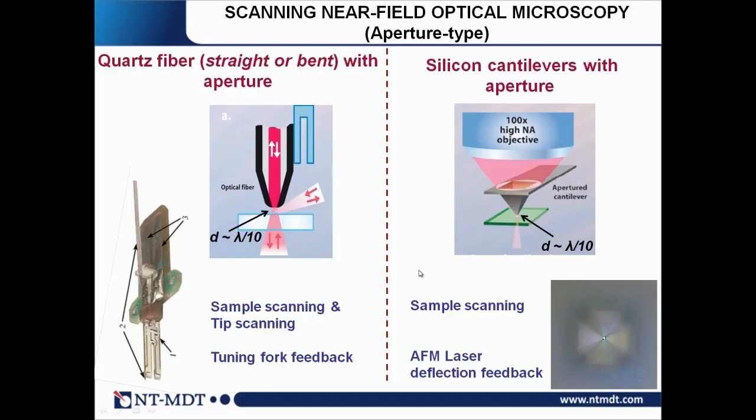So I would like to finalize my today's presentation with a scanning near field optical microscopy technique. This is another approach to optical imaging with a resolution beyond the diffraction limit. It works nicely with highly optically active samples which have a lot of light on the surface. It does not work with Raman, and this is a classical technique already, but still there are a lot of new interesting things appearing with applications, different probes and methodology.